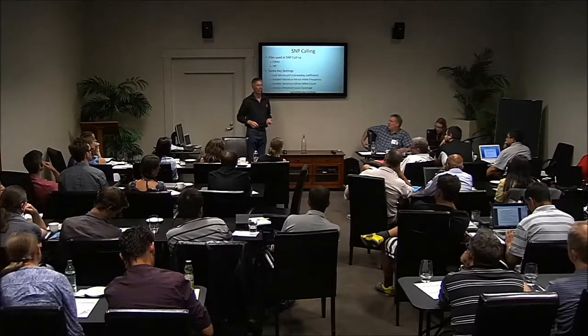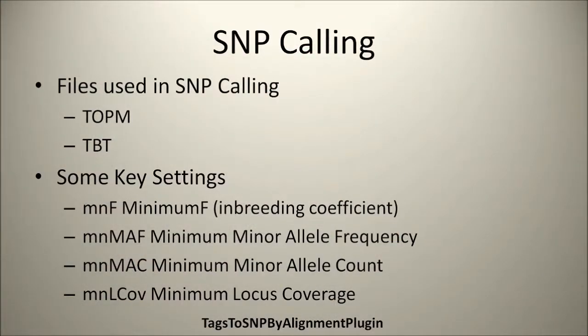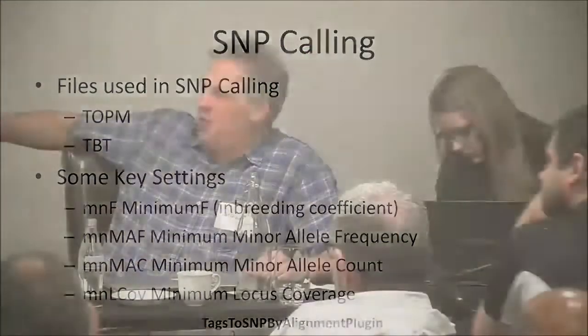And I highly recommend that. Yeah. So there's a -ref option, and then you tell it the path to the reference genome, and it'll pull a tag out of the reference genome at the same spot, which is really good if you may not have a cut site in the reference genome. So you want to make sure it's there. In case there's an insertion or deletion, you can still tell where the SNPs are relative to that reference genome.